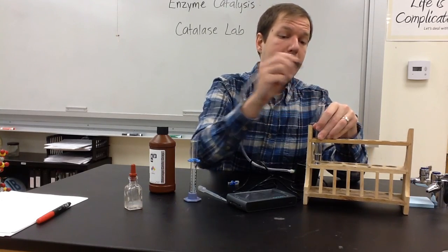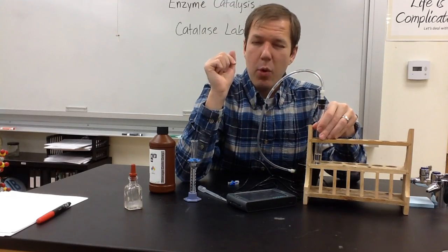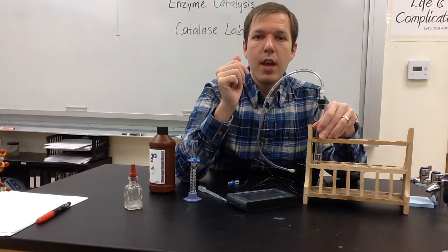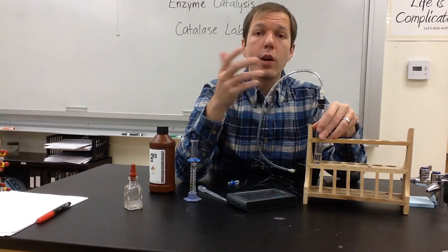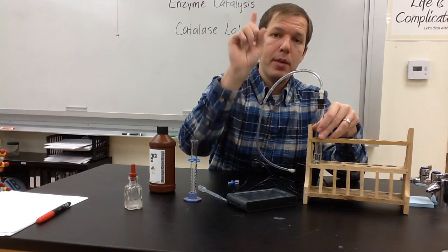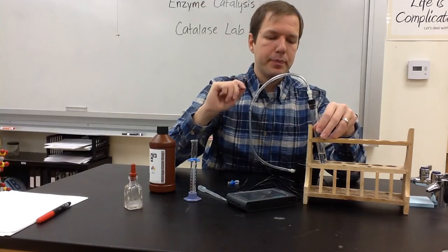So if you delay in putting the stopper on, or once the stopper's on, delay in hitting start on your LabQuest, that's going to delay the beginning of your collection of data, and your first few data points might not be able to compare as well to each other. So work together, using many hands, to accomplish those three things: adding the enzyme, stopper, and LabQuest, all at the same time, or as close to the same time as possible.